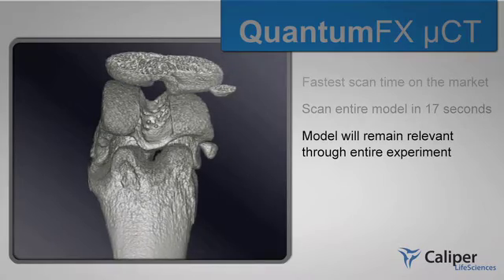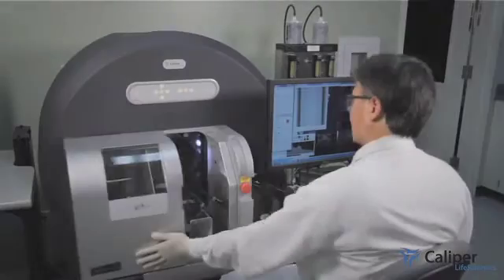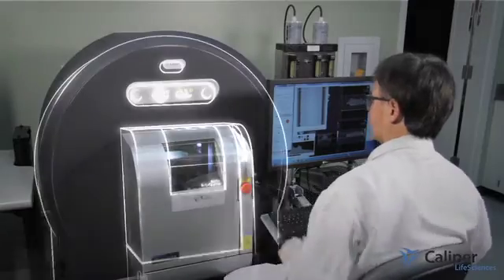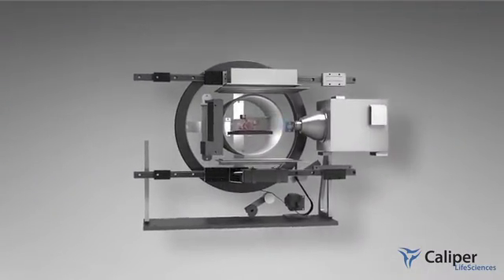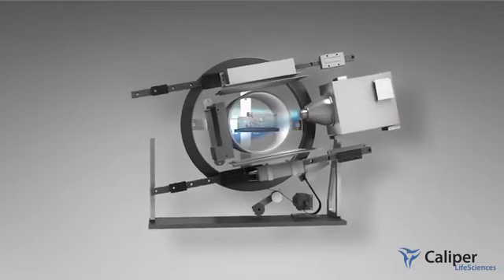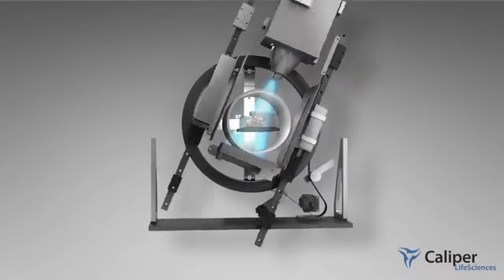The QuantumFX micro-focus cone beam x-ray source, continuous motion gantry and flat panel detector provide unparalleled performance for fast, low-dose imaging.